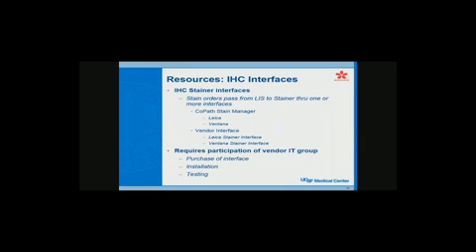And so now we've got stains going two different ways. The system, stain dictionaries, order dictionary, everything has to be set up to make sure that those things feed the right stainer. Every stain is set up to run on one type of stainer. So this requires a lot of coordination between Copath, the vendors, and our own IT group.